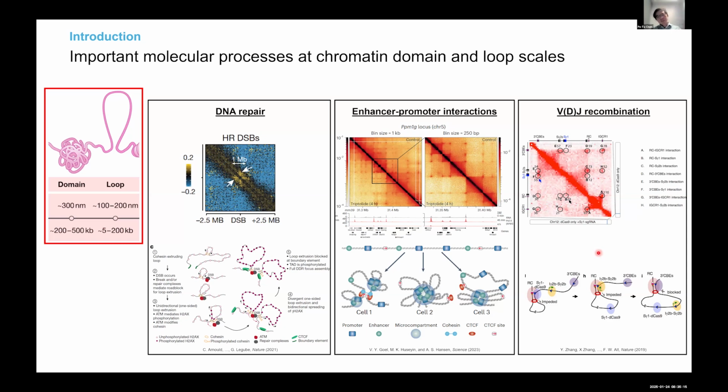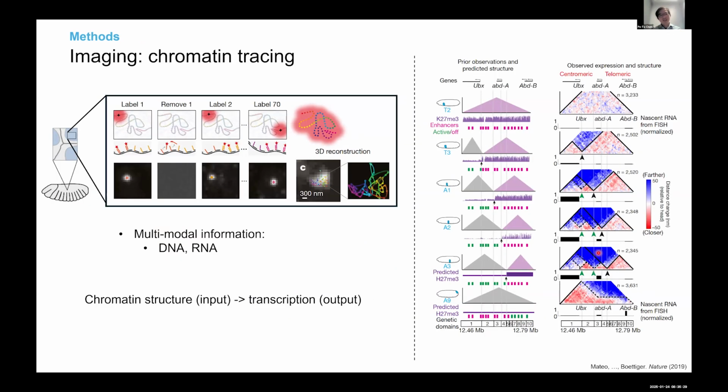If we look into the tools people have been using to study problems at this scale, Hi-C, chromosome conformation capture, is definitely one of the go-to tools. But in our lab, we also want to look at the imaging side to complement this information. On the imaging side, pioneered by a group of people in Xiaowei's lab, Alistair, Stephen Wang, Long Kai, they came up with a similar method.